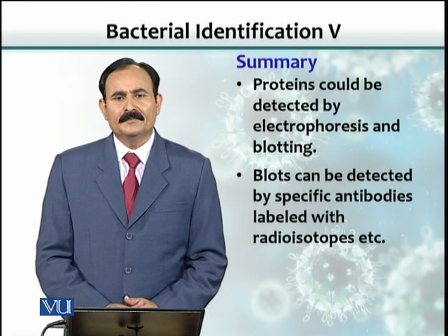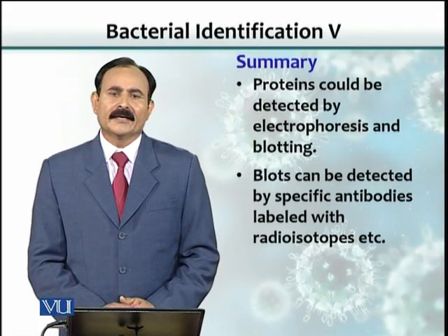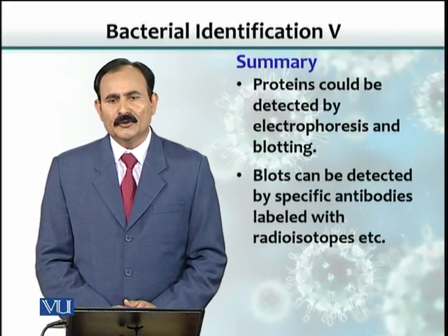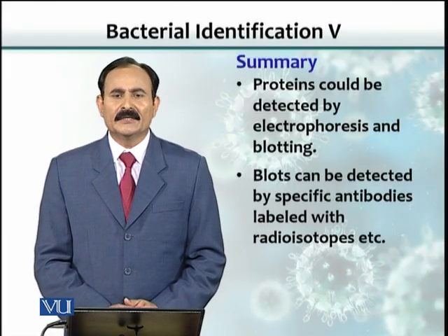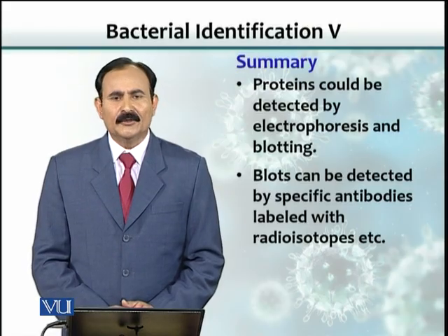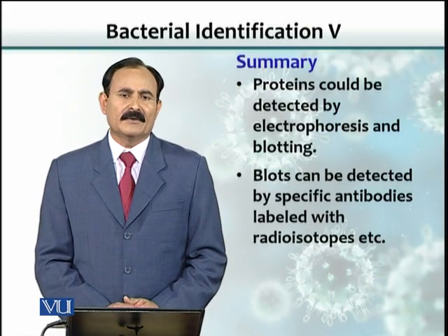In summary, proteins could be separated by electrophoresis, and those proteins could be blotted onto a filter paper. That filter paper could be soaked with specific antibodies, and those bands that interact with those antibodies could be detected.